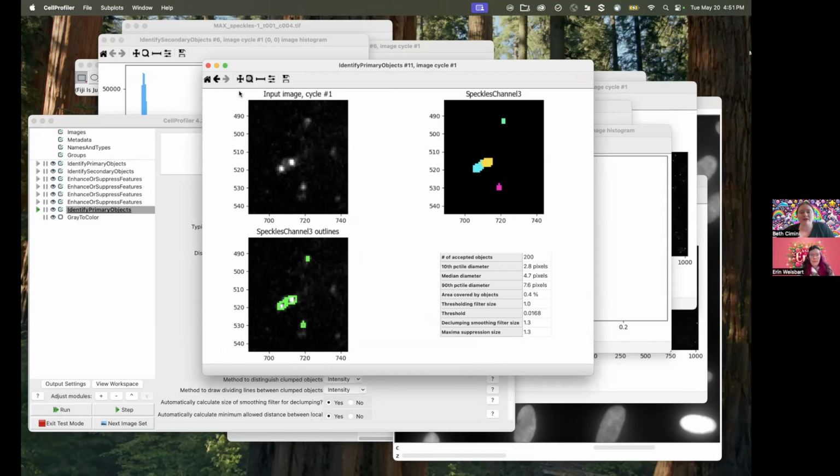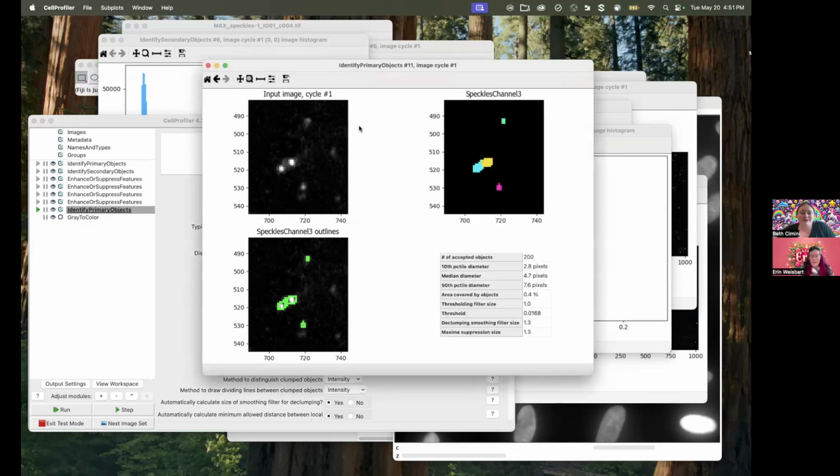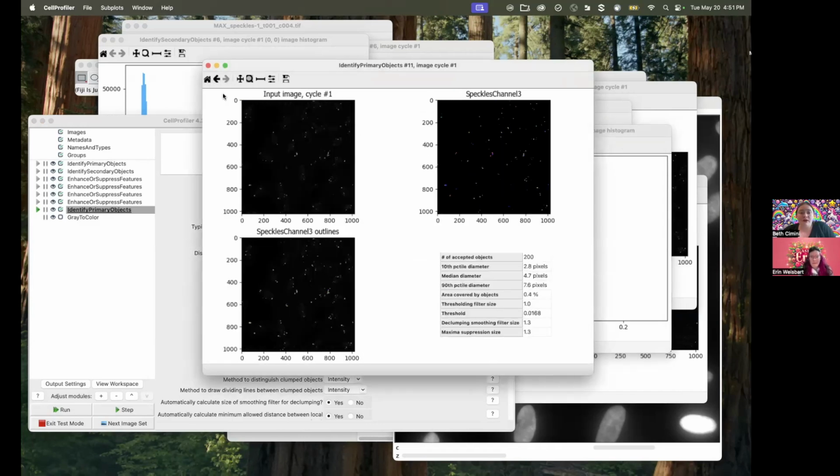So sometimes I will play around with that if it seems like we're pretty close to having something where we have a single peak after clipping that is only our background. But with time and experience, I have done that less and less. All right, this looks great.